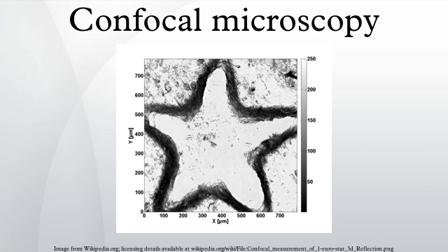3 types of confocal microscopes are commercially available. Confocal laser scanning microscopes use multiple mirrors to scan the laser across the sample and descan the image across a fixed pinhole and detector. Spinning disc confocal microscopes use a series of moving pinholes on a disc to scan spots of light. Since a series of pinholes scans an area in parallel, each pinhole is allowed to hover over a specific area for a longer amount of time, thereby reducing the excitation energy needed to illuminate a sample when compared to laser scanning microscopes. Decreased excitation energy reduces phototoxicity and photobleaching of a sample, often making it the preferred system for imaging live cells or organisms.